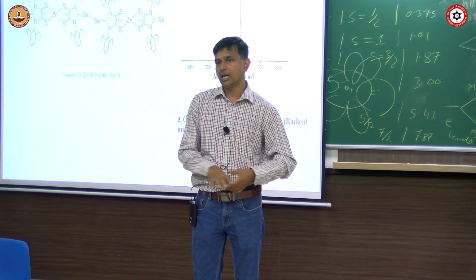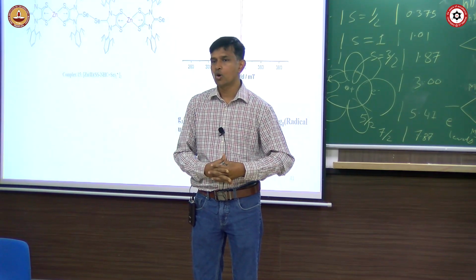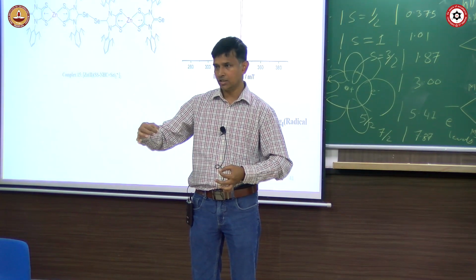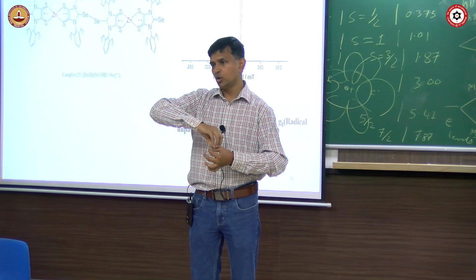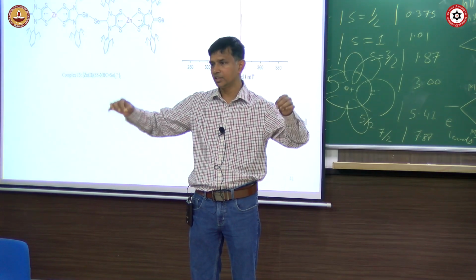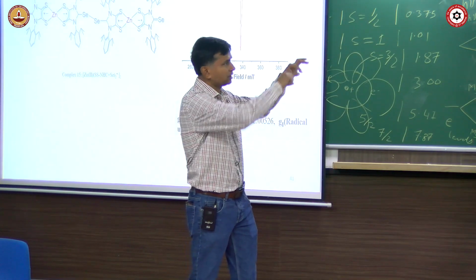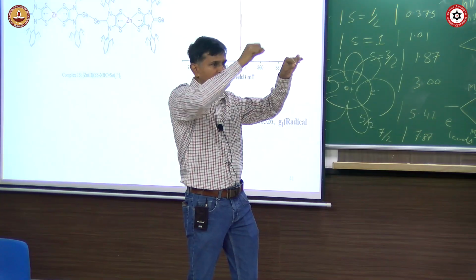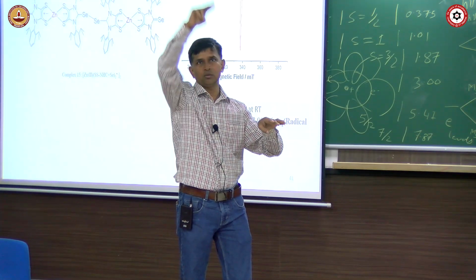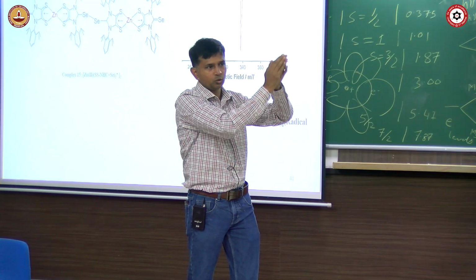Now how does coupling to the nucleus work? In biological systems, copper is often connected to histidine. Histidine has a nitrogen and a pi star orbital. So electron density from the copper also partly goes to the histidine side, and then they start showing coupling due to the nitrogen also. So all these lines will come, and they will further split due to the nitrogen. So 4 lines and then one big line you see. Now every line will start splitting due to the nitrogen also.